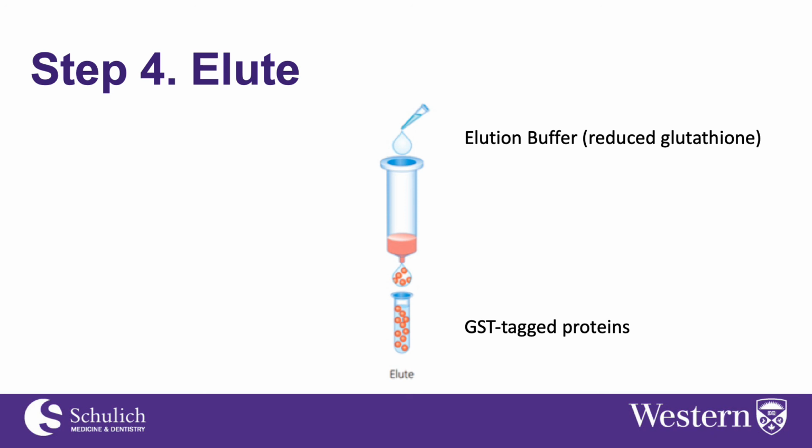For subsequent use and analysis, the GST tag can be removed with a site-specific protease as it may affect analysis. In our lab, we will be performing SDS-PAGE analysis to determine the molecular weight of proteins in our sample.